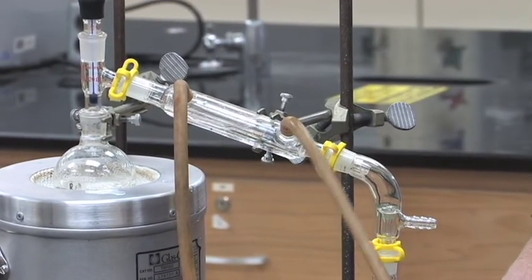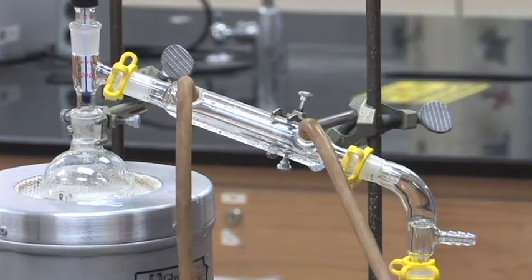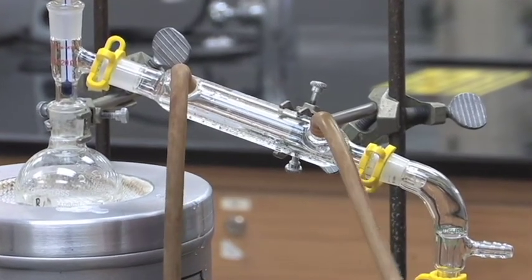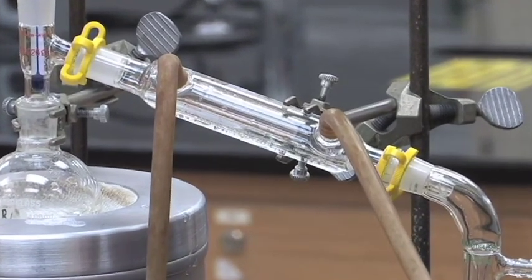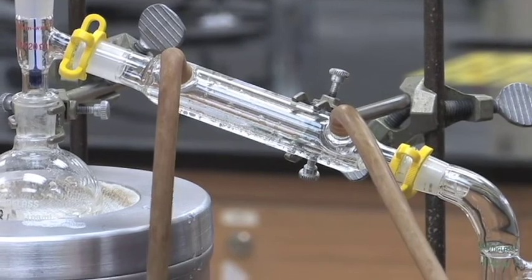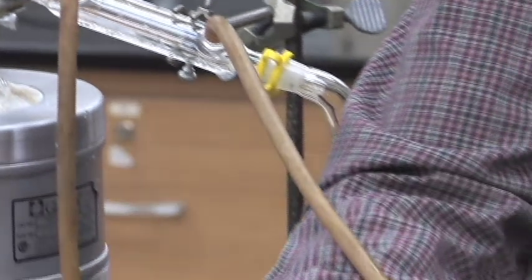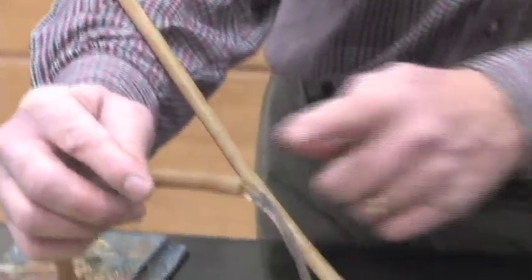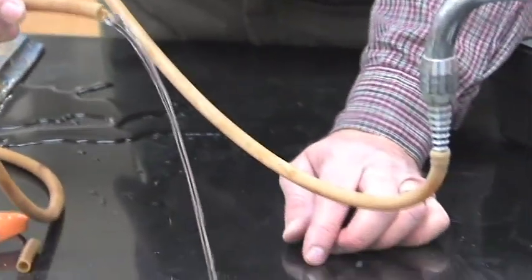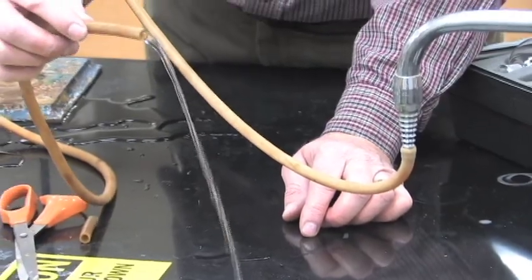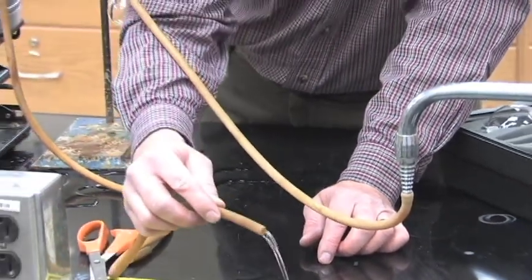But we turn the hose on, turn the water on at the outlet. And when you're using the water going through a distillation or a reflux, all you need is for the water to drip off from the outside end of the hose straight into the sink. You shouldn't be able to spray the water across the lab or you have it on too high.